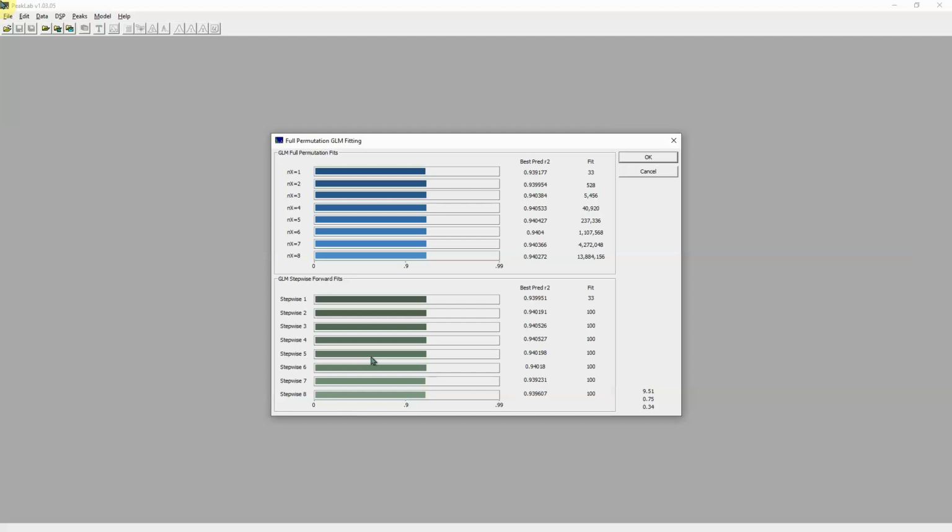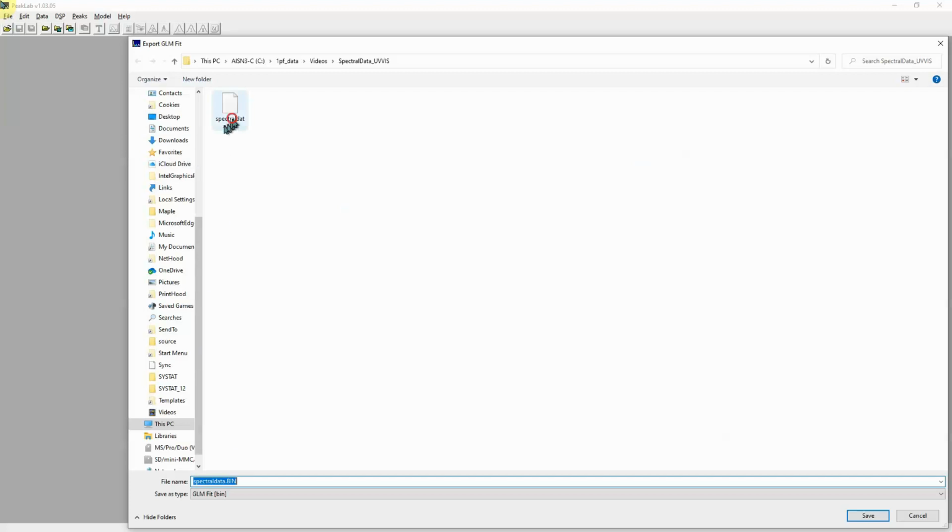Now these smart stepwise fits begin with the best of the saved full permutation fits and add additionally statistically significant predictors using a multiple tier search routine. It may perform thousands of exploratory fits in generating just a single final model from an especially strong set of initial predictors. We will first save the full fit information.